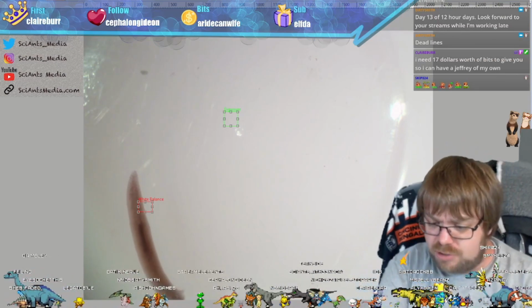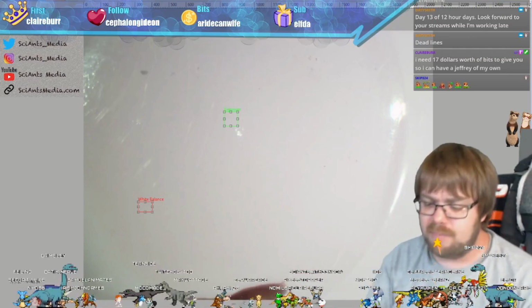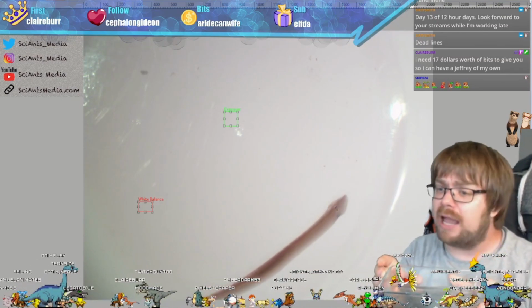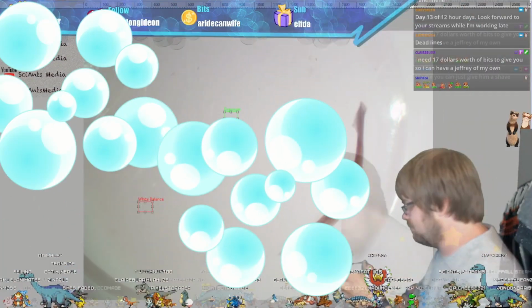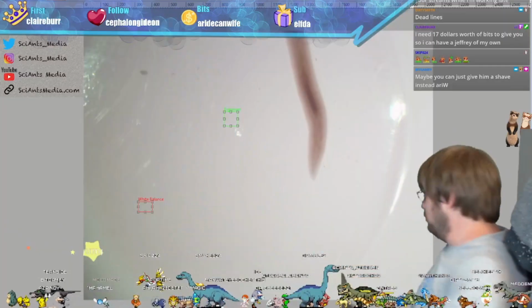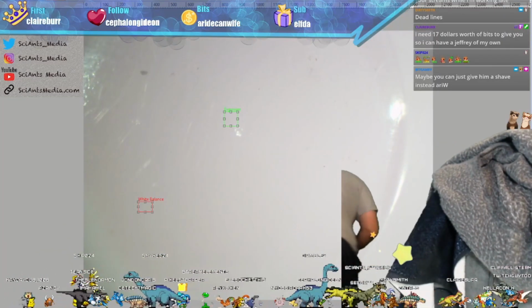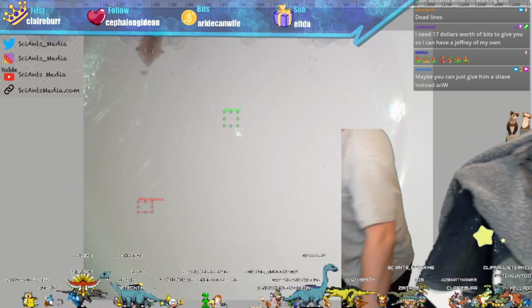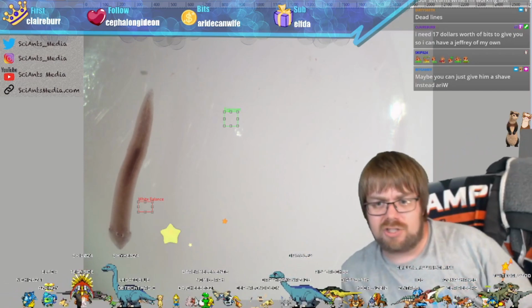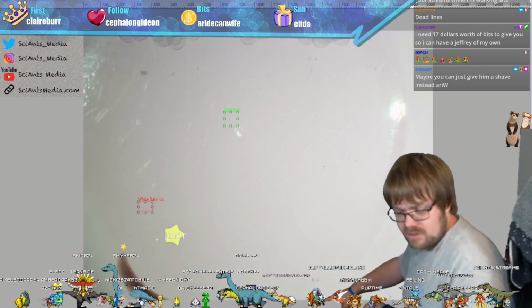What I'm actually going to do, chat, is he was in this Pyrex container. I'm going to empty this container totally right now and refill it with brand new water so it's extra sterile for him. I want it to be super, super sterile. I'm also going to use a new suction tube to move him post, just to make sure that we have everything as sterile as possible. Oh, and I need some gloves.